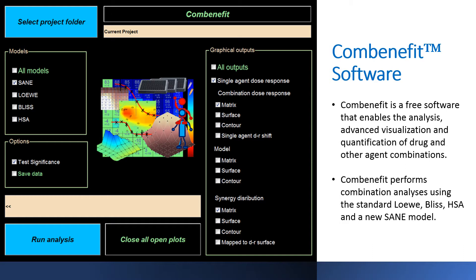ComBenefit is a free software that enables the analysis, advanced visualization and quantification of drug and other agents' combinations. ComBenefit performs combination analyses using the standard Loewe, Bliss, HSA, and a newly developed SANE model. The purpose of this video is to provide a quick guide to the basics of how to set up ComBenefit and run synergy analyses with the software.